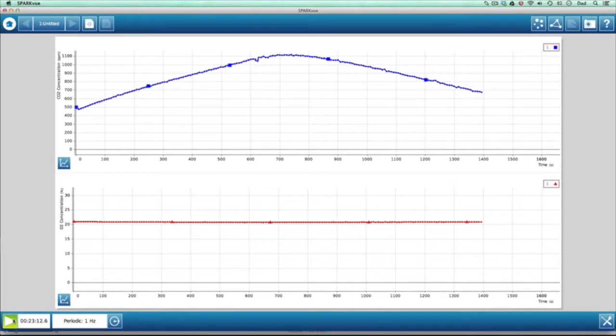You can see, again, pretty even progression from start to finish. But I wanted you to look at this blip, station 1, this blip, station 2, and then all of this from here to here. So why don't we talk a little bit about what happened at each of those stages. We'll go ahead and open discussion here in just a moment. Take a look at those 3 stations, and then we'll talk about what happened to the oxygen.